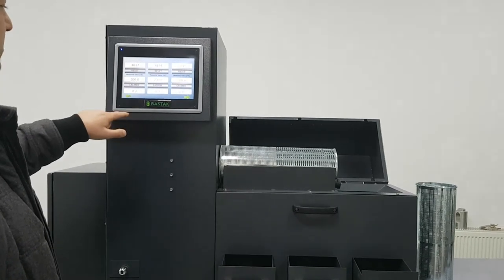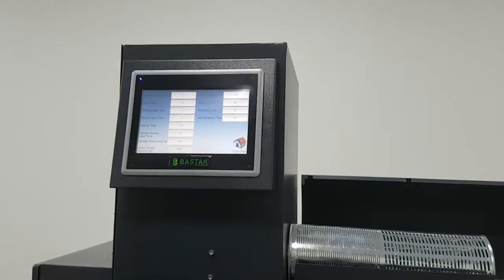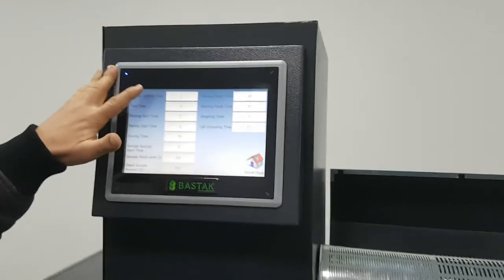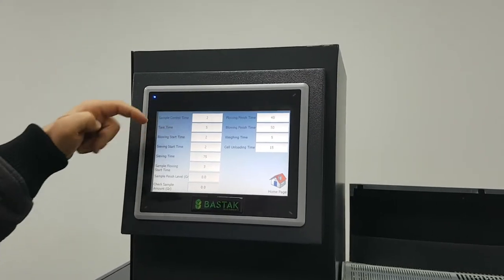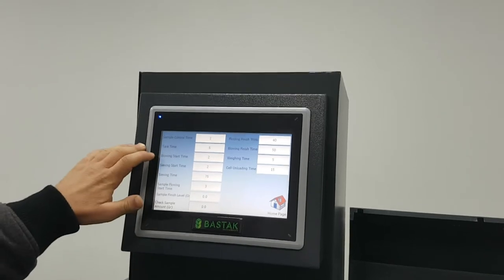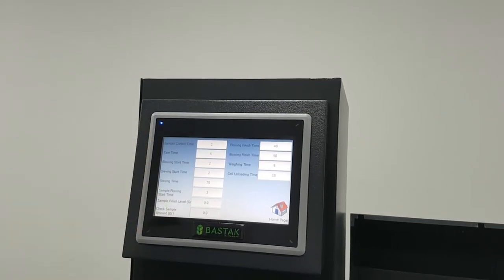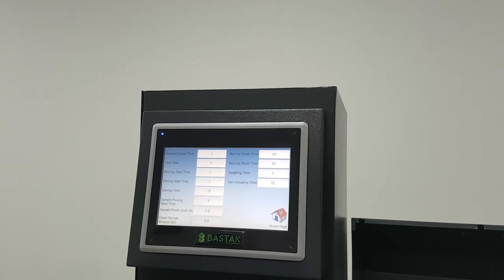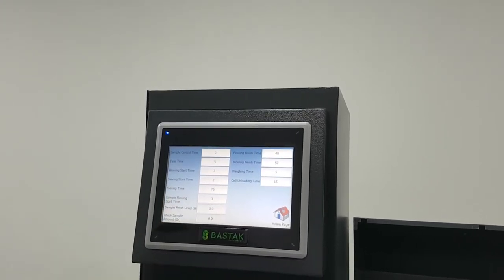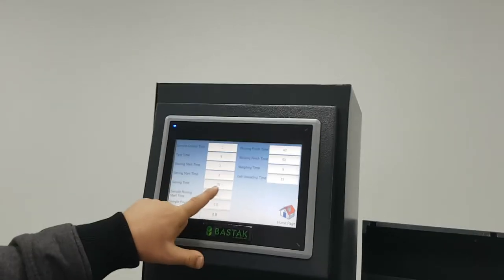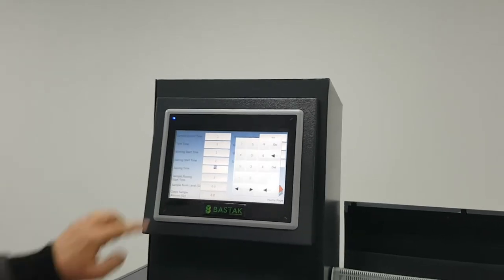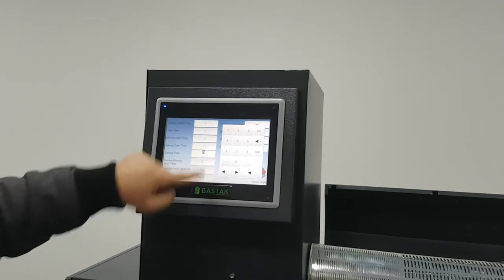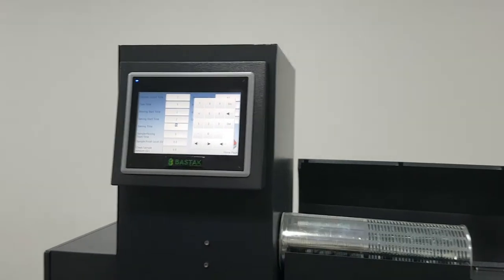We go back to the home page now. If we press on the Bastak menu, we have the sample control time. Before, when we add the sample, how many seconds it will control. How many seconds it will tear. Blowing start time after pressing the start button - in two seconds, it will start blowing air. Sieving start time - the cylinder will start to turn after two seconds. Sieving time will continue for 75 seconds continuously. We can change this by pressing here. We can make it more or less depending on our sample amount.